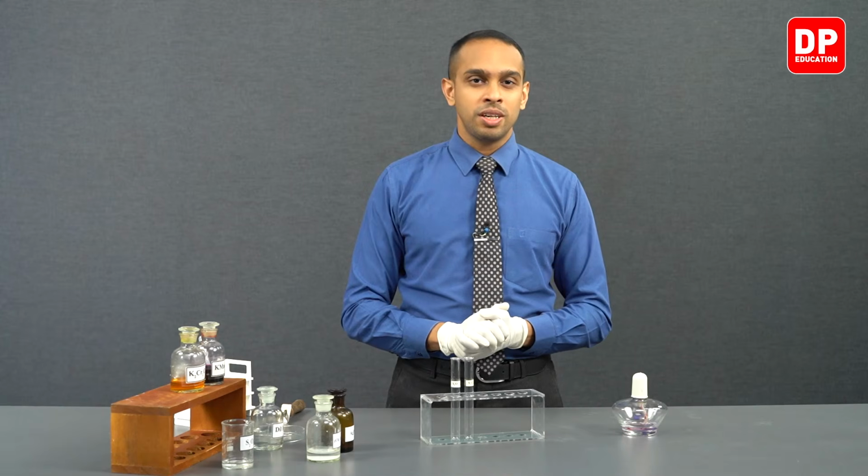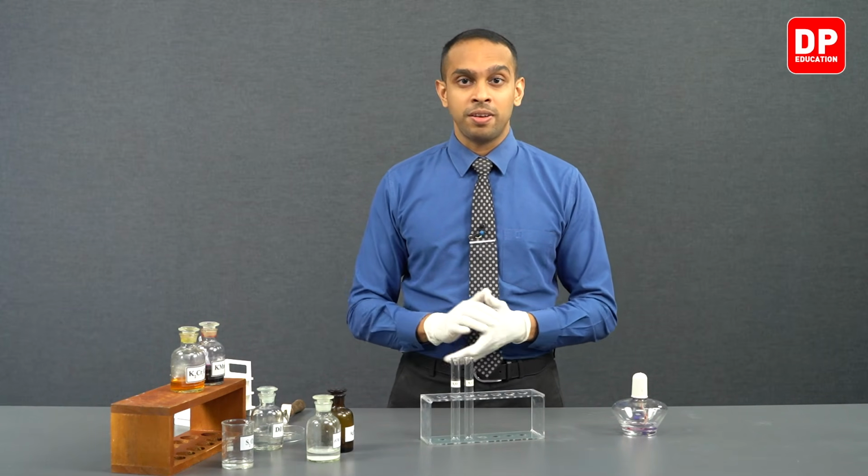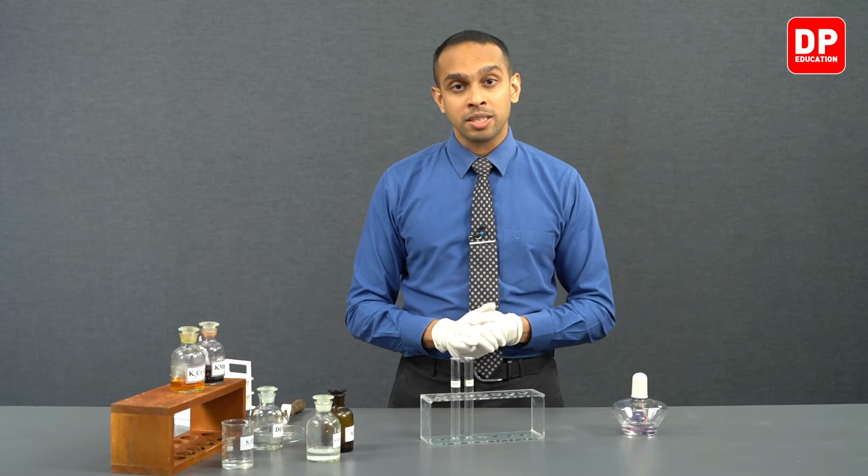So to observe how these ions react with the thiosulfate ion, we will mix sodium thiosulfate with silver nitrate to observe what changes take place when we mix these two solutions.